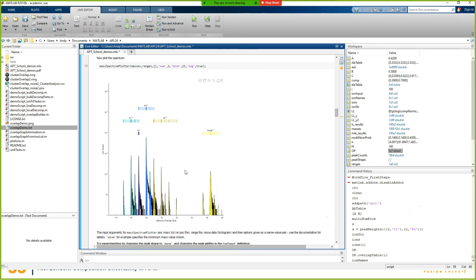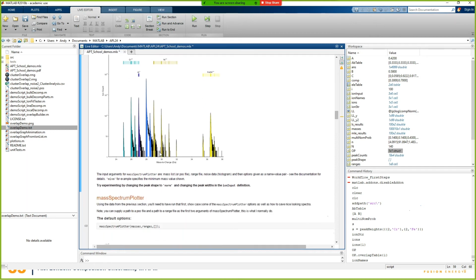There's a stick option I'll show you later on, because that's a little bit easier to interpret, especially in linear space. But the wider the bar here, the more intense that peak. So this gives you a sense of where you've got different peaks and where they overlap. Here we can see we've got chromium, aluminium, and iron. They all overlap here. I think in my examples, I often use these ions. Atom Probe Lab does work with any ion. It's not just iron, chromium, and aluminium. Those are just my go-to thing to look at.